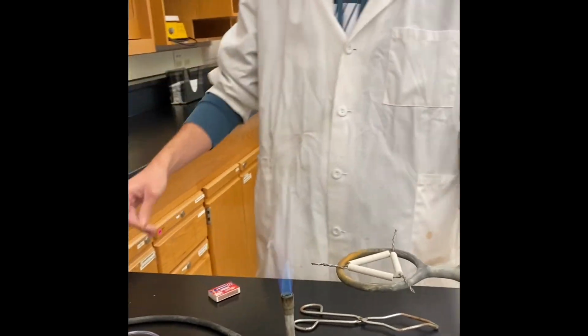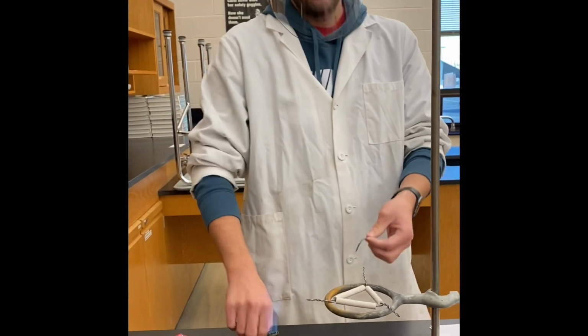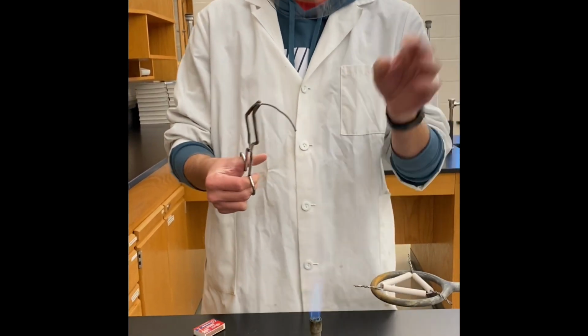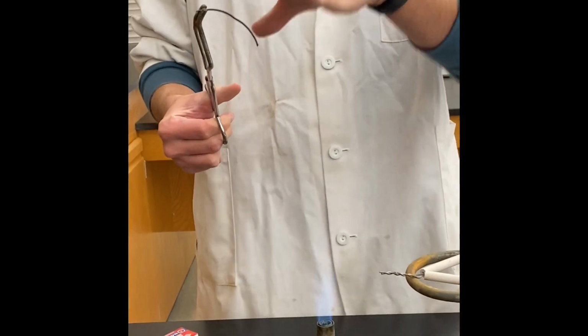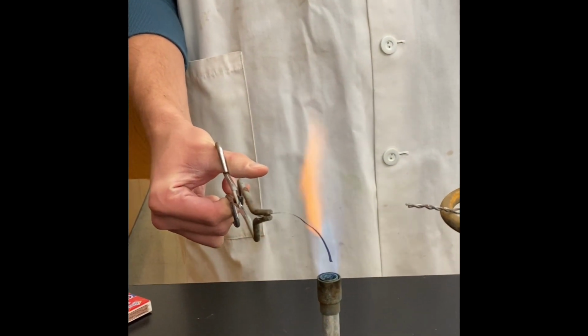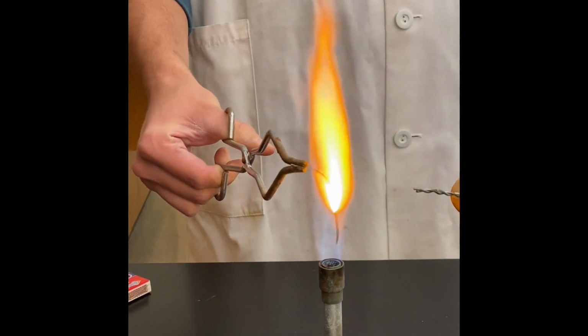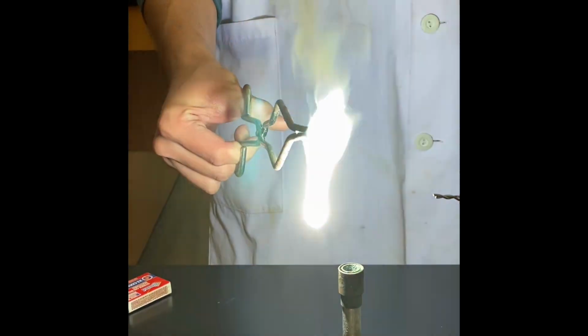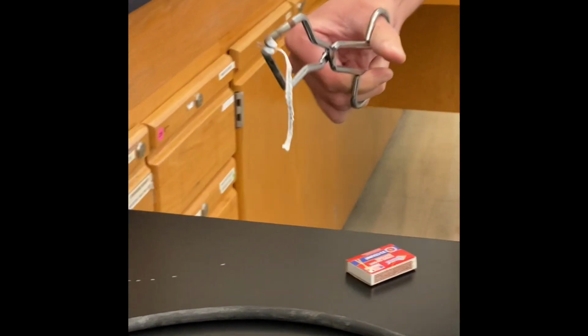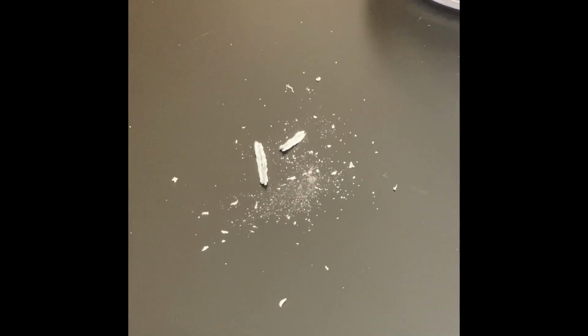So to make magnesium oxide, we need a Bunsen burner and a strip of magnesium. And I'm going to hold the magnesium in the flame so that the oxygen from the air attaches on to the magnesium. So that white substance on the lab table now is the magnesium oxide.